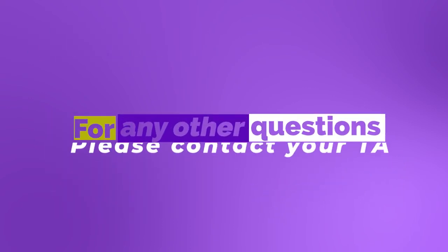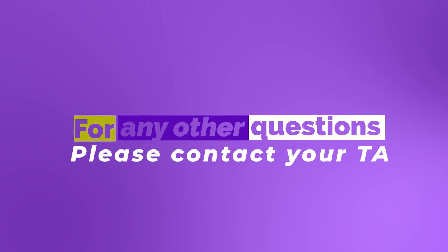So this is the basic setup for the calculation section for experiment 14. If there are any further questions, go ahead and make sure to contact your TA.